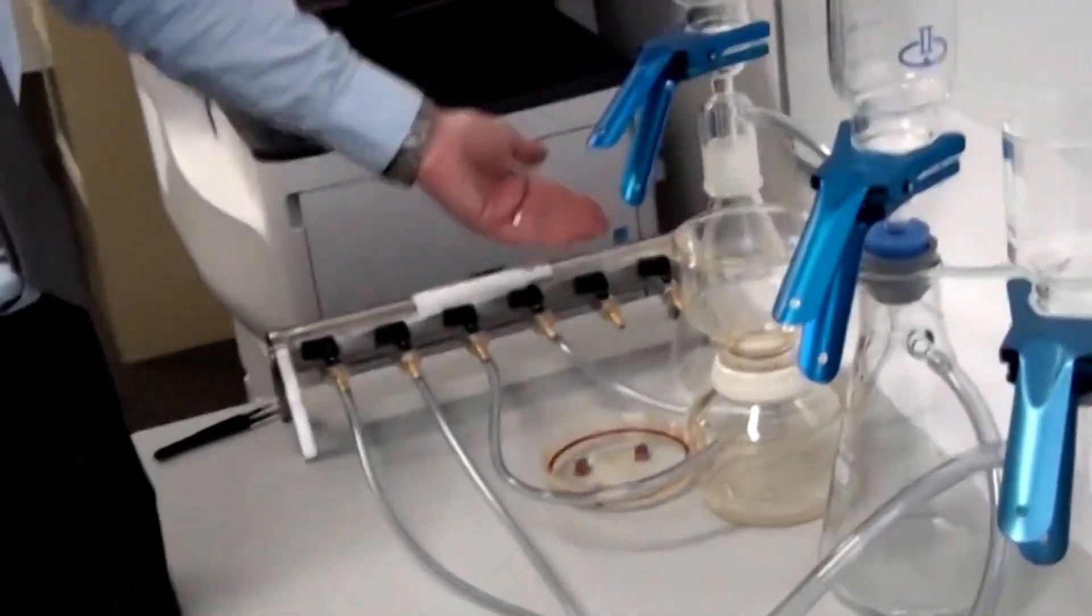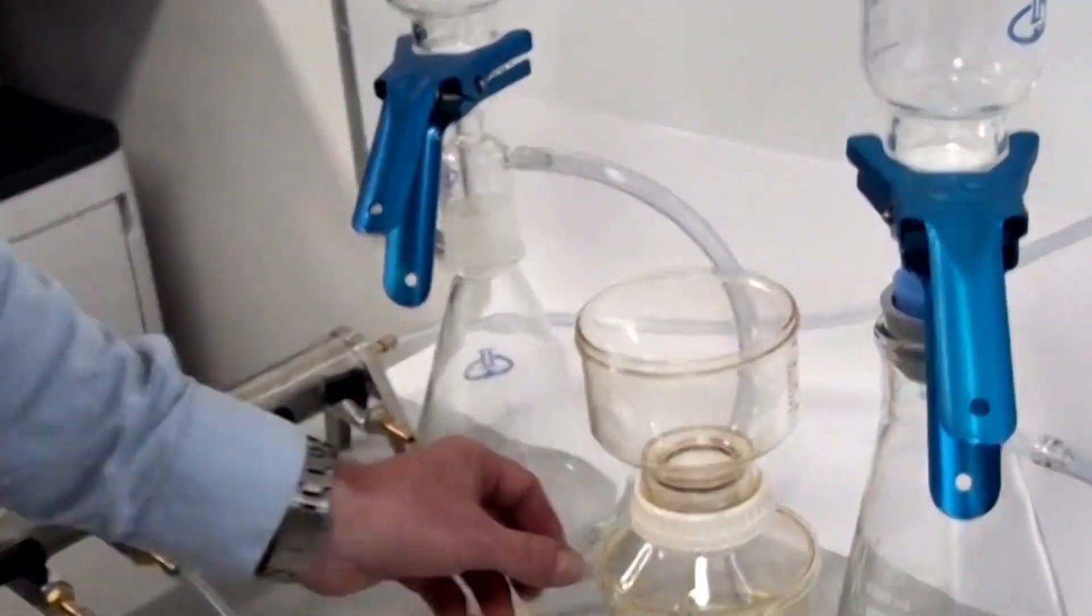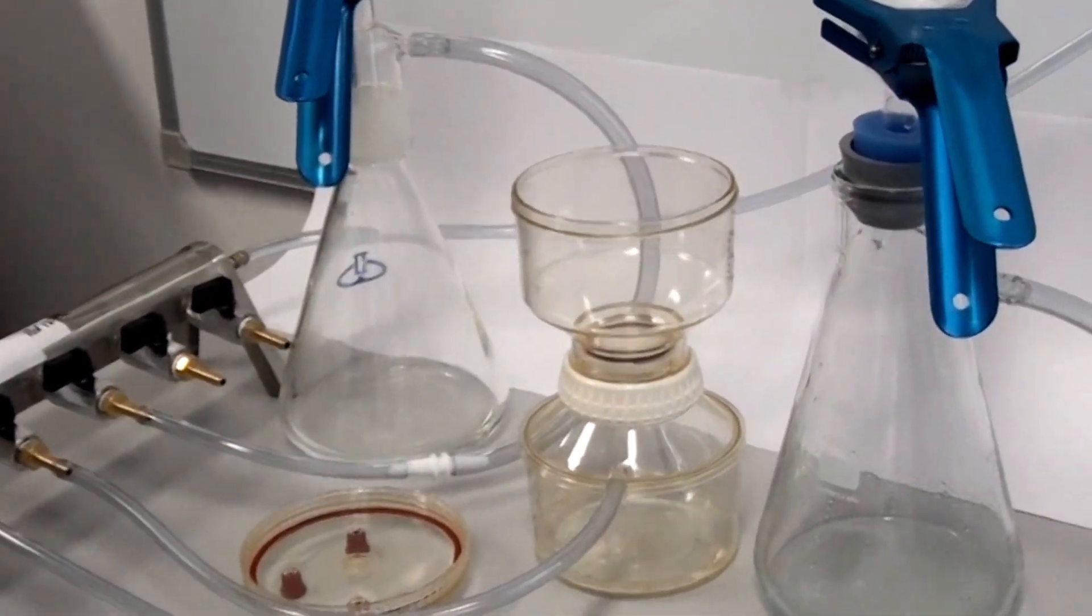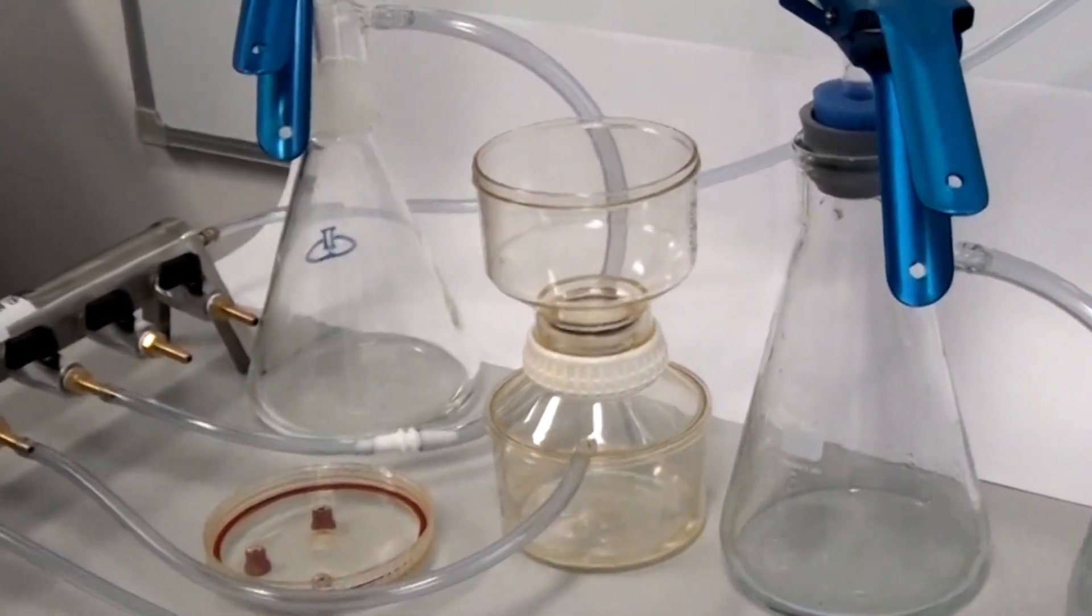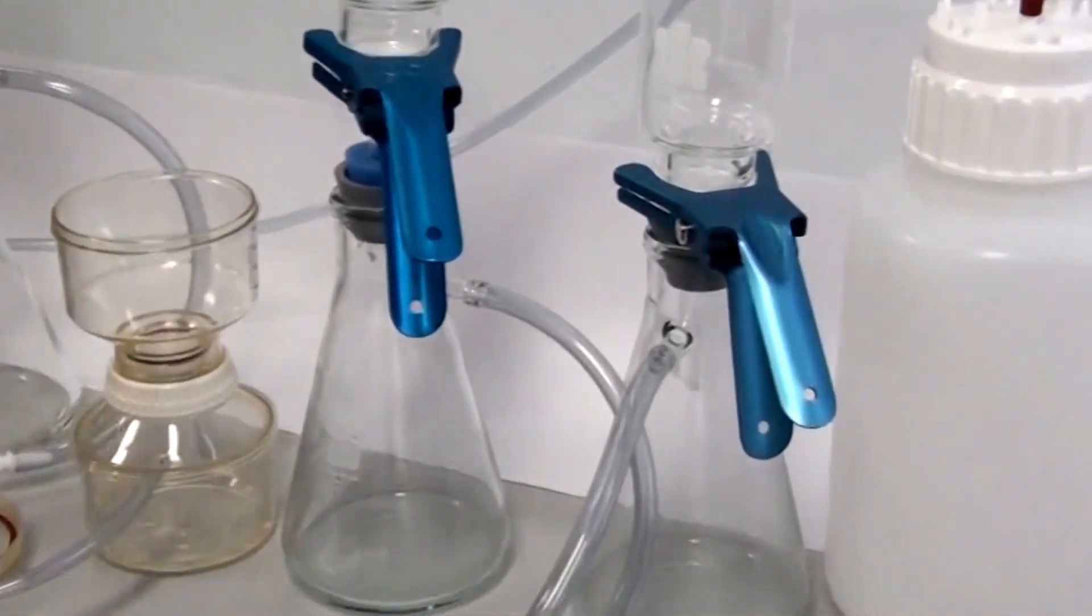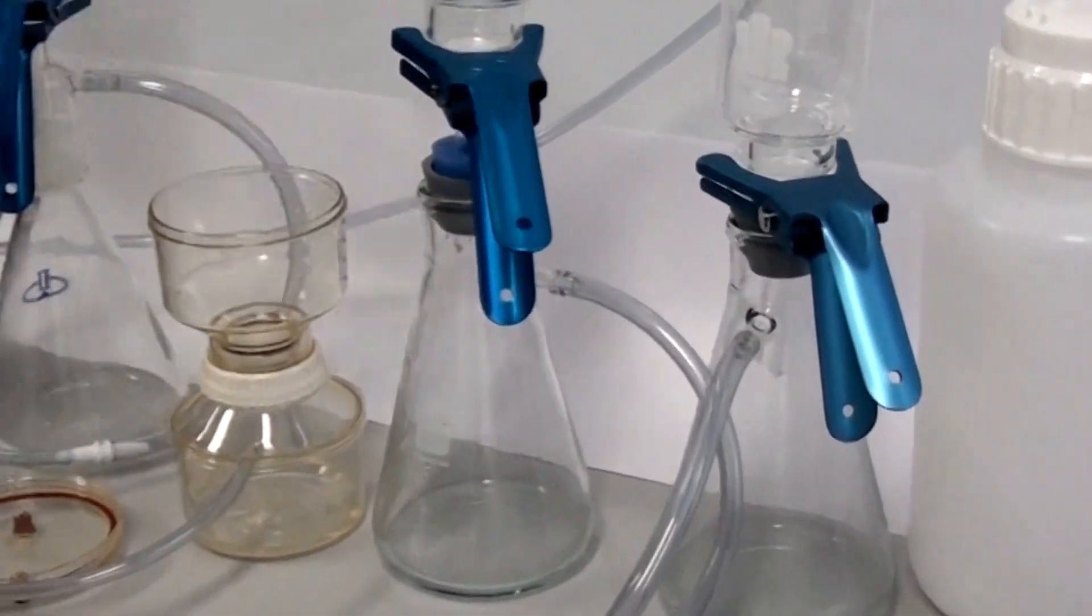So all the liquid's passed through and been collected in the flasks. The PF1202, that's autoclavable, polysulfone type plastic. Obviously these glass flasks can be autoclaved. The whole top section can be autoclaved.